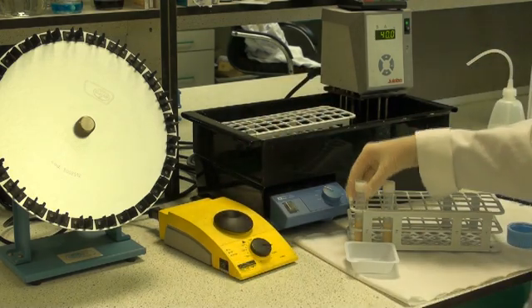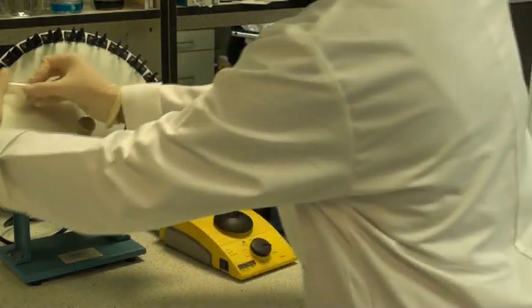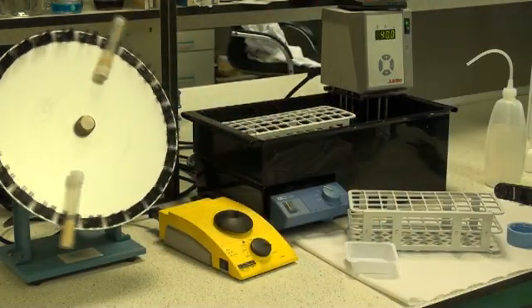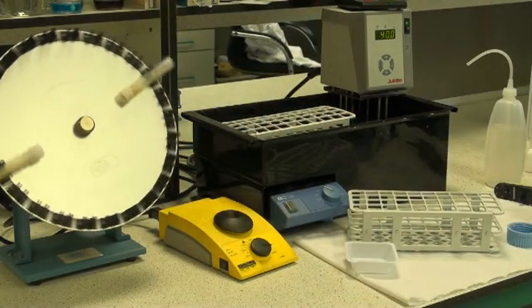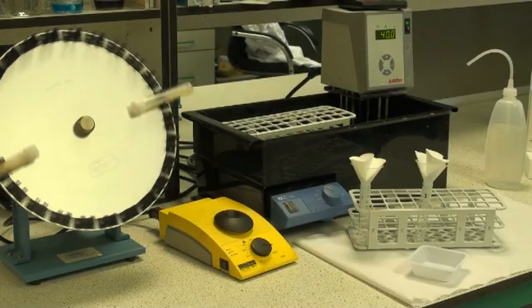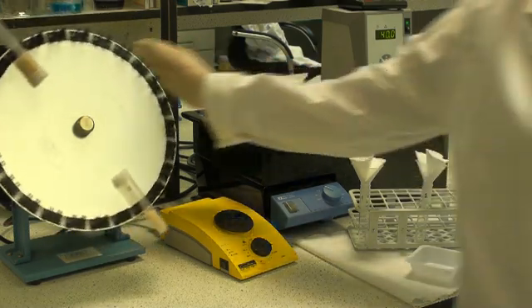Alternatively, the tubes can be placed in the Stuart blood tube rotator and allowed to rotate over the 1 hour period. After 1 hour, turn off the rotator and remove the tubes.